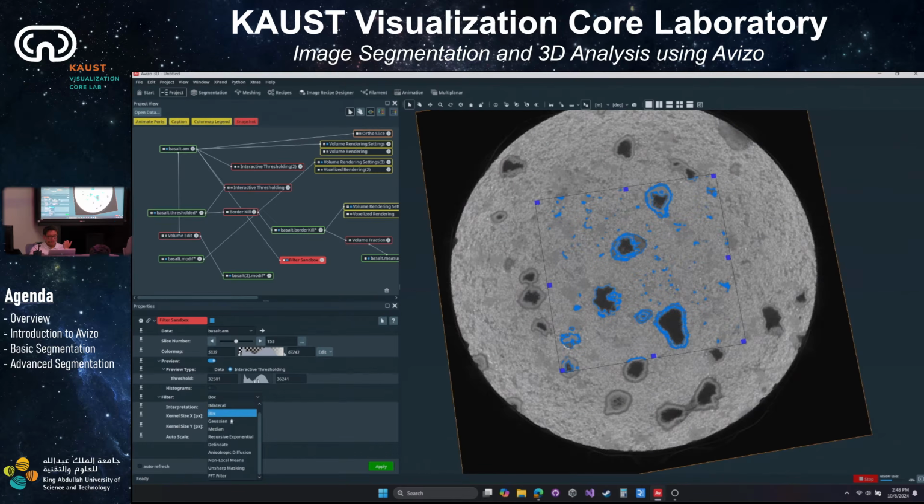So just by trying different things, trial and error, and a little bit of experience, I found that if I do this disk, I get something decent, right? I hope you see it. That now the mineral is kind of easier to threshold, right? It's not going to be perfect, and I mean, we don't have time to get like a super perfect result, but let's say I'm happy with this. I click apply.